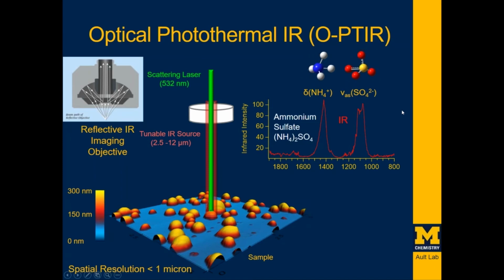These are well-known systems. Of course, now we're working towards more complicated ones. This is just meant to show an example. In both cases, the dipole moment shift gives you a really nice IR spectrum. If we only had this, we would have been really excited, frankly, because now we were able to look much more quickly. These spectra were a lot faster than the AFM PTIR, and have been quite reproducible for us.